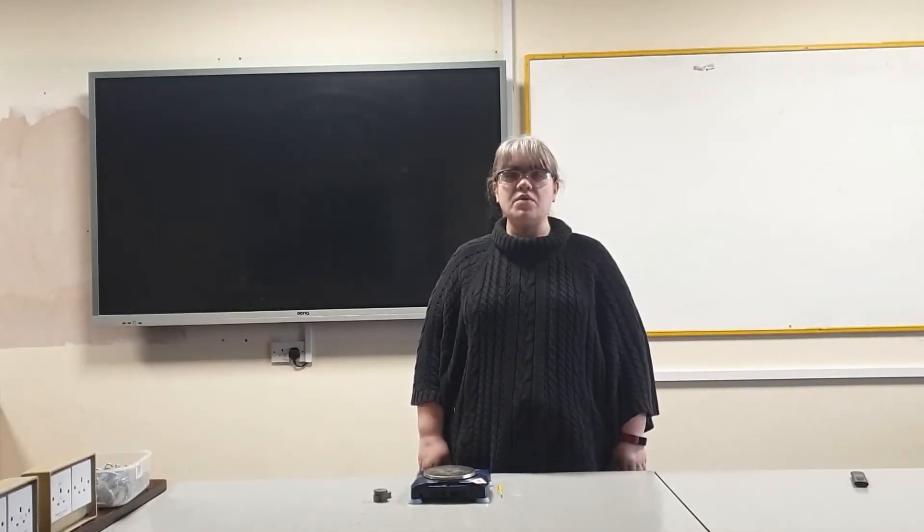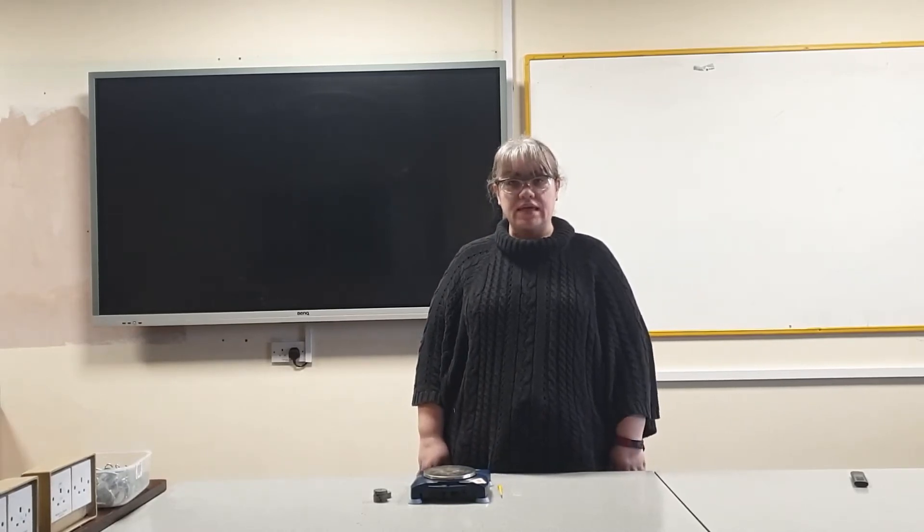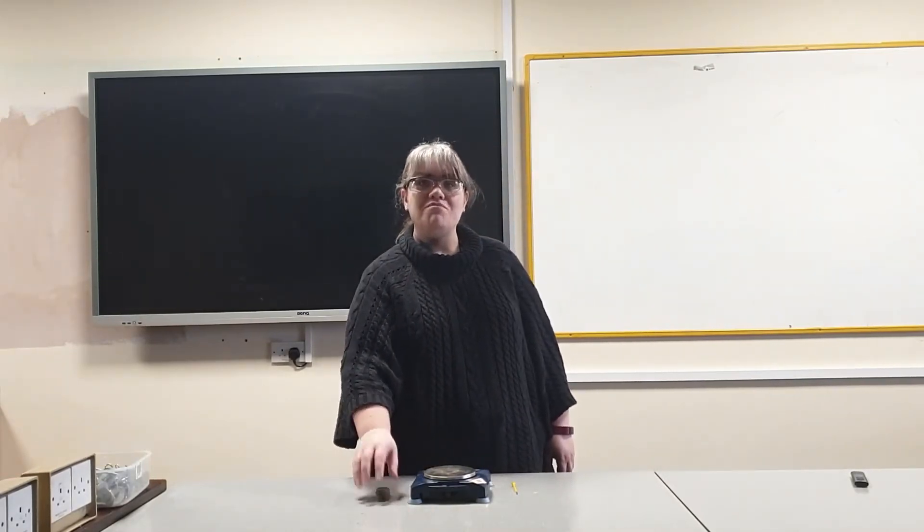Hello, today I'm going to show you how to calibrate a balance. You will need a balance, a small screwdriver, and a range of masses.